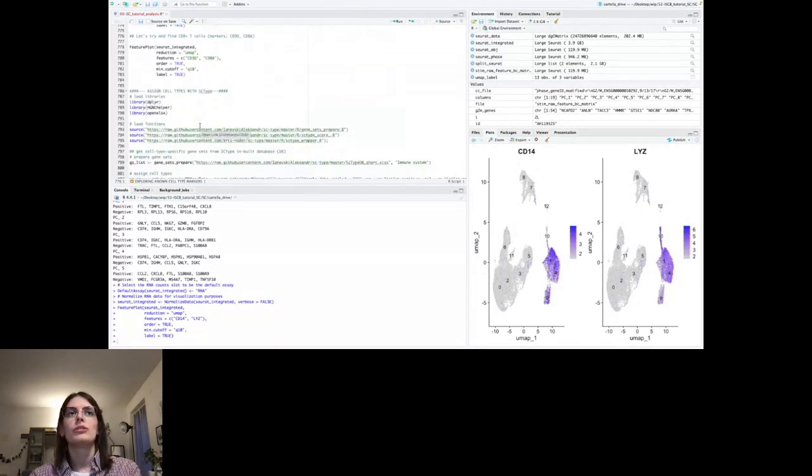But I also want to show you how to use this tool, which is called SCtype, which is of very great help when you are not actually an expert of your cell types. This is a tool that, given a set of genetic markers, both positive and negative, has many cell types already available with all these markers, and it automatically calculates a score that is somehow a probability that that cell is of that cell type, given the transcriptional profile, and assigns the cell type automatically.